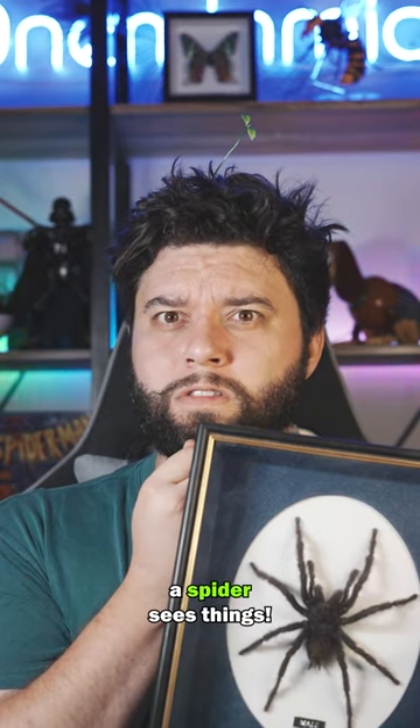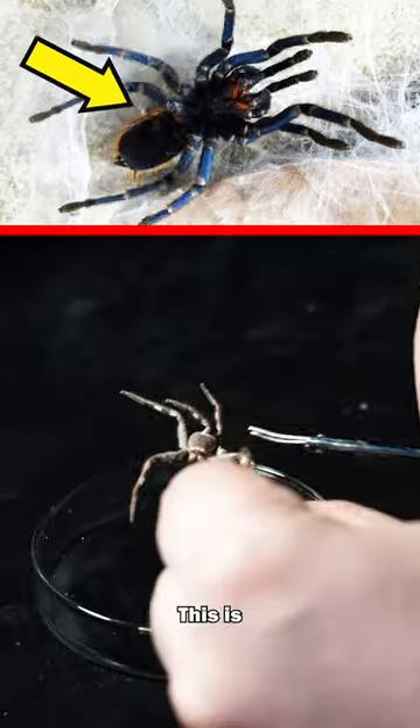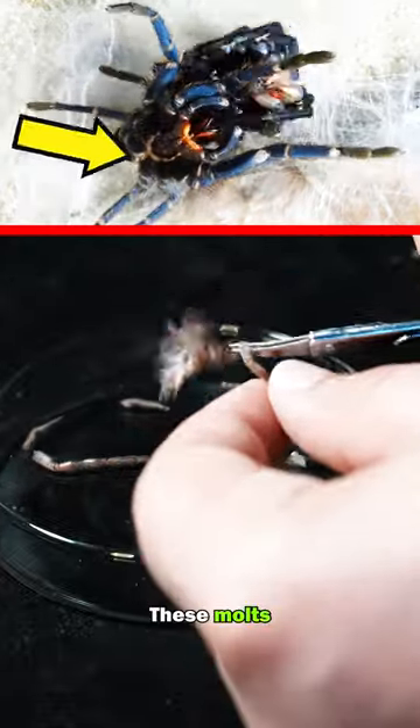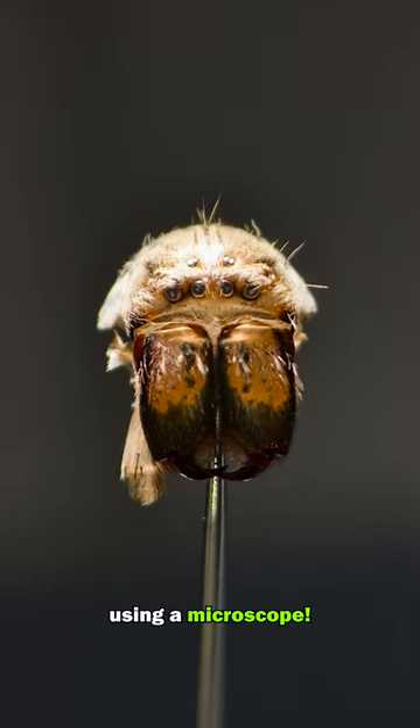I've always wondered how a spider sees things. I've got an idea — I'll use this old spider molt. This is from a spider that has shed its skin as it grows. These molts include eye lenses of the spider, and we can look through the eyes using a microscope.